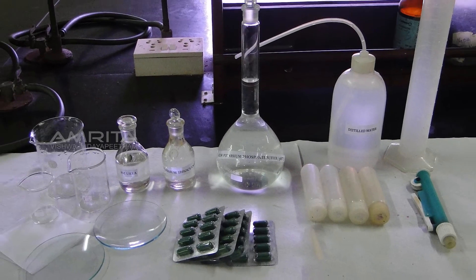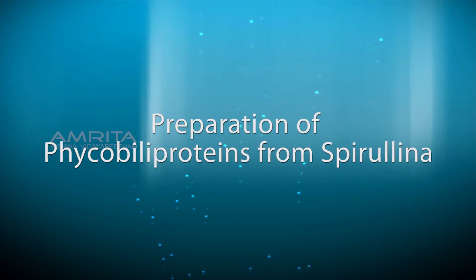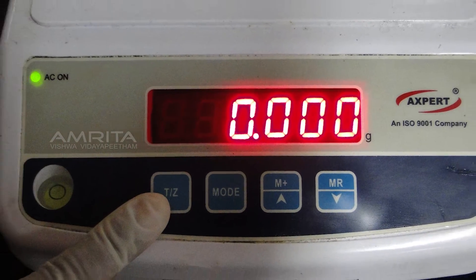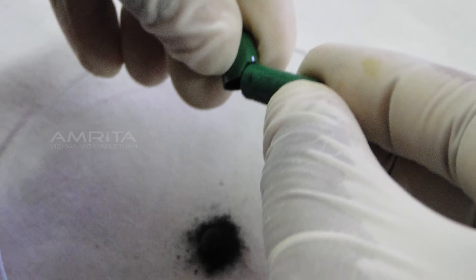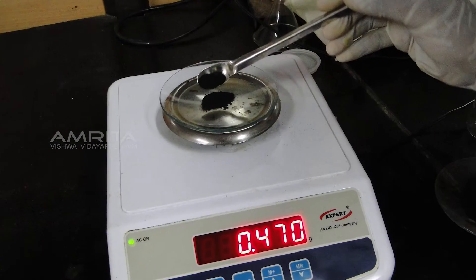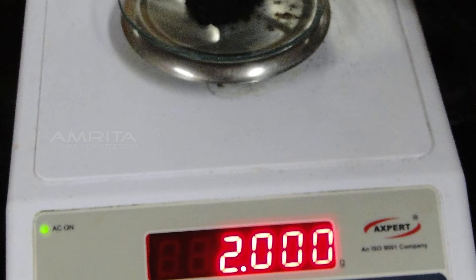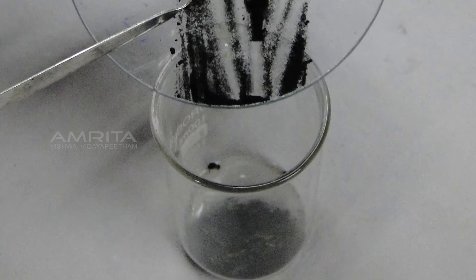Arrange the required materials on the lab bench. Preparation of Ficobili proteins from Spirulina: Place the weighing dish over the weighing balance and tare the balance to zero. Take four Spirulina tablets, open them and empty the contents into a watch glass. Using a spatula, transfer the Spirulina powder from the watch glass onto the weighing balance and note the weight, which should be approximately 2g. Transfer the powder into a 100ml beaker with a spatula.